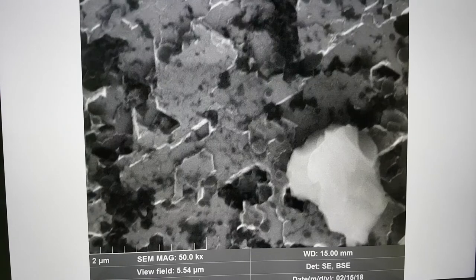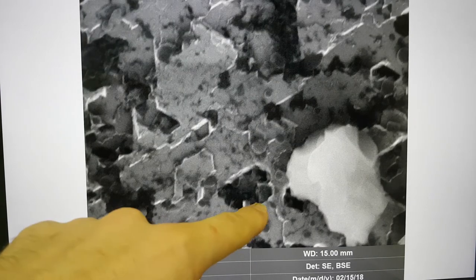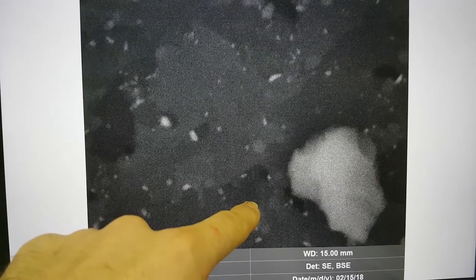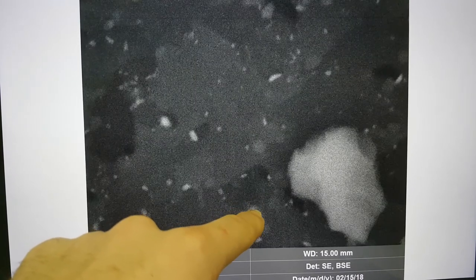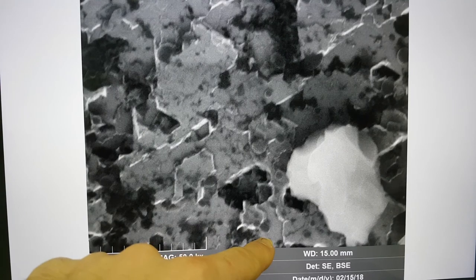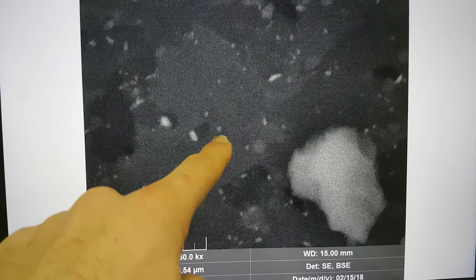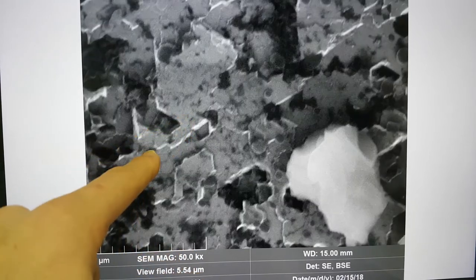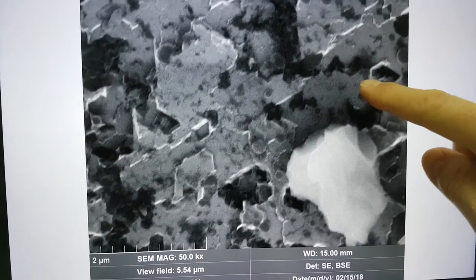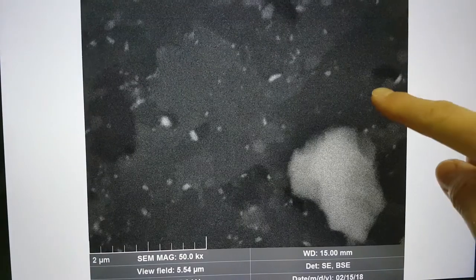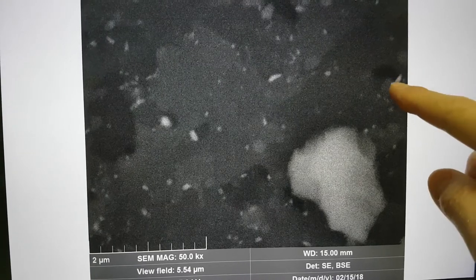It's just odd. You've got, for instance here, a ball that's going down into this cavity. Maybe the beam can't get in there so it can't determine it. But it really starts getting very clear, this sort of process where it's eating down in this direction, eating down in this direction. This is eaten across to one side and then down, it's gone up and down, and it's left its other element wetted to the surface.